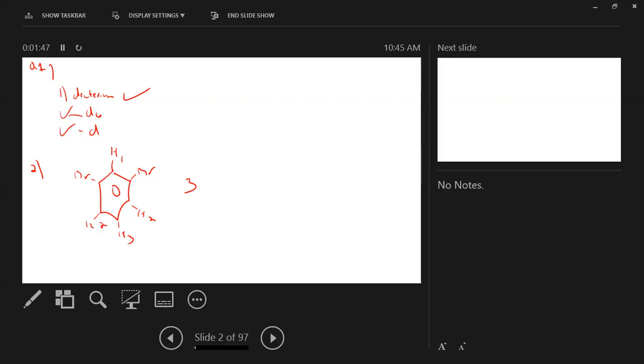So for methylpropene, we can even do this on this slide too. What we have. Here's methylpropene. How many different signals do we have? I'm going to call this one A, and all these ones are going to be B. So then you're going to have 2 signals.